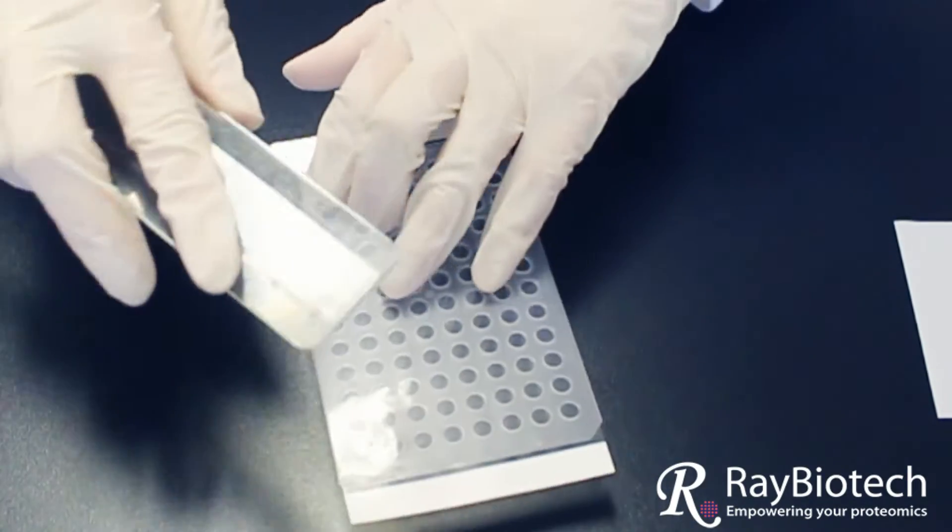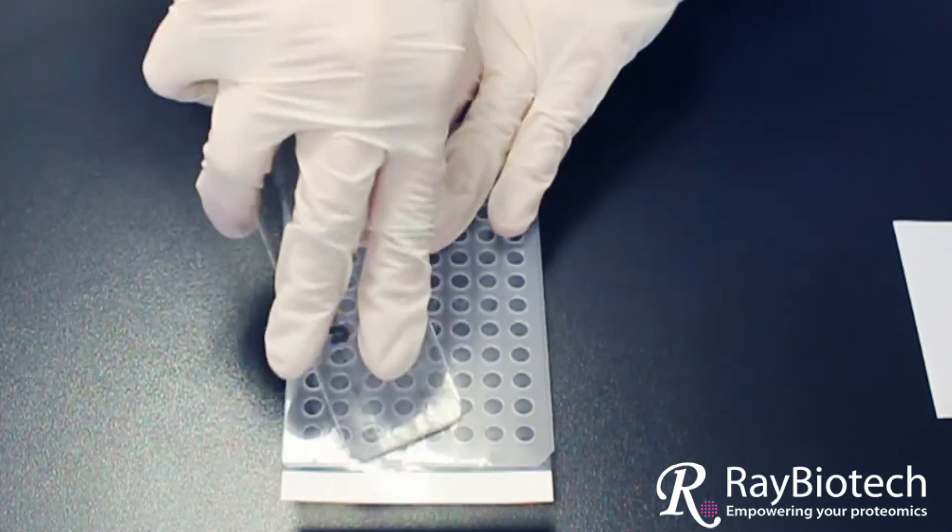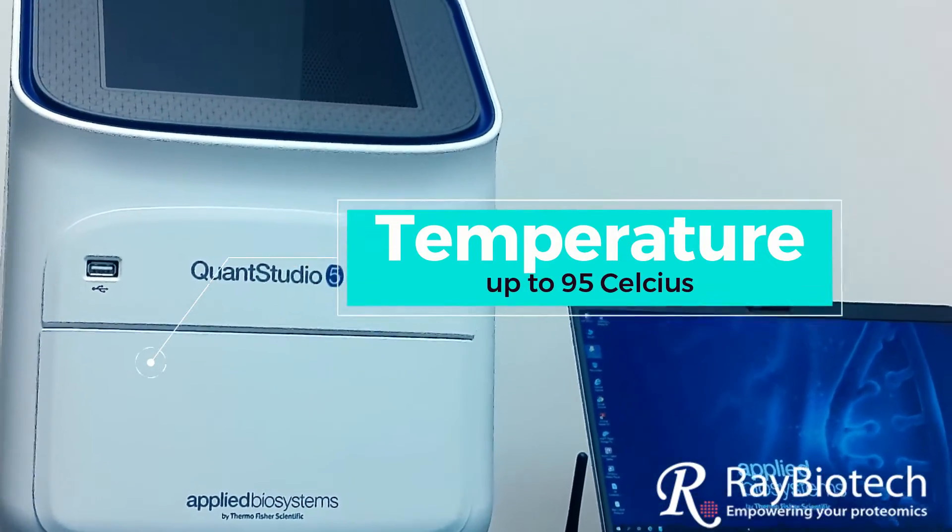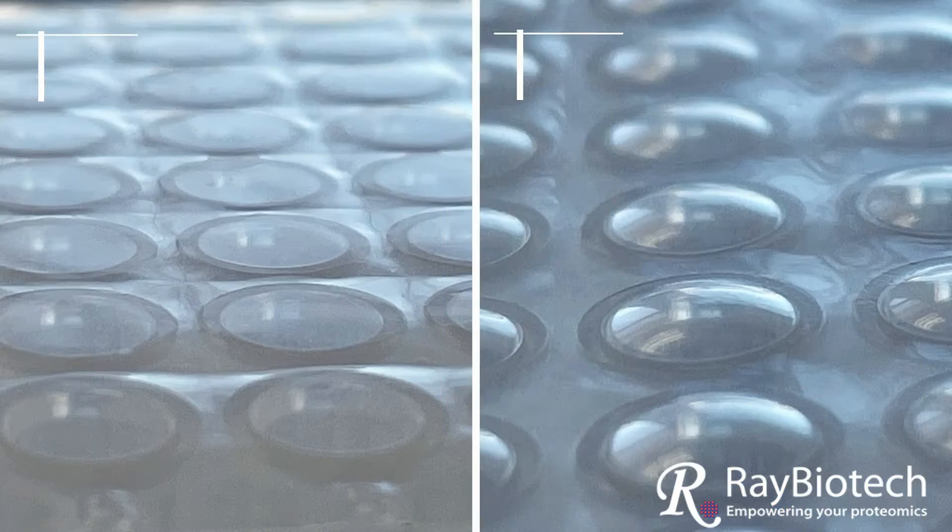The ruler should be used to press the film firmly against the edges of the wells. During the reaction, the thermocycler will reach up to 95°C. Expansion of air will place pressure on the seal.